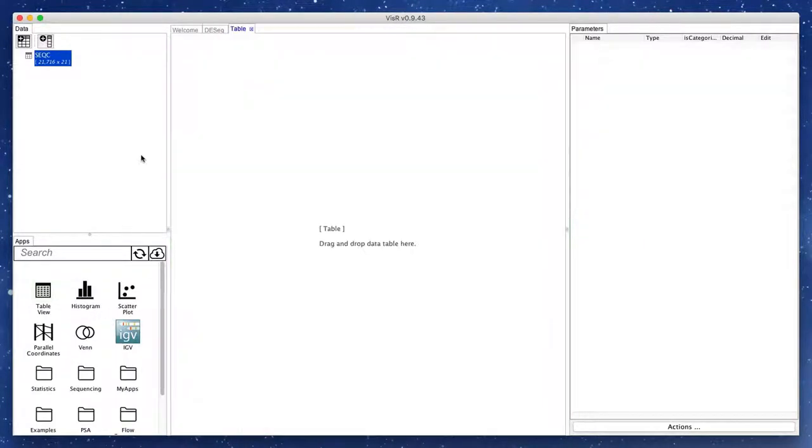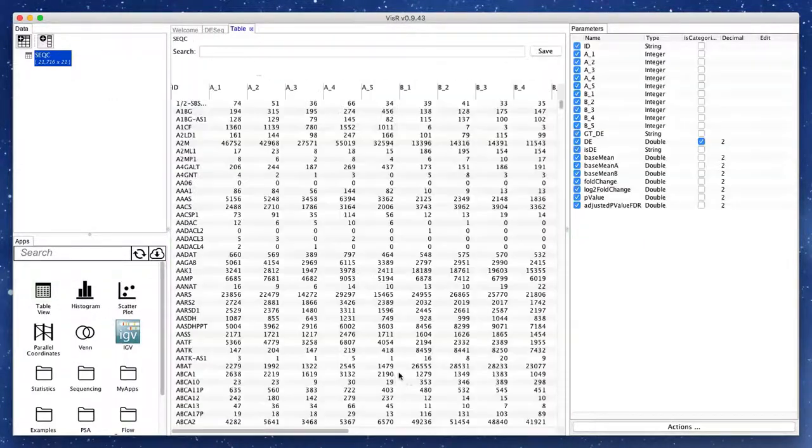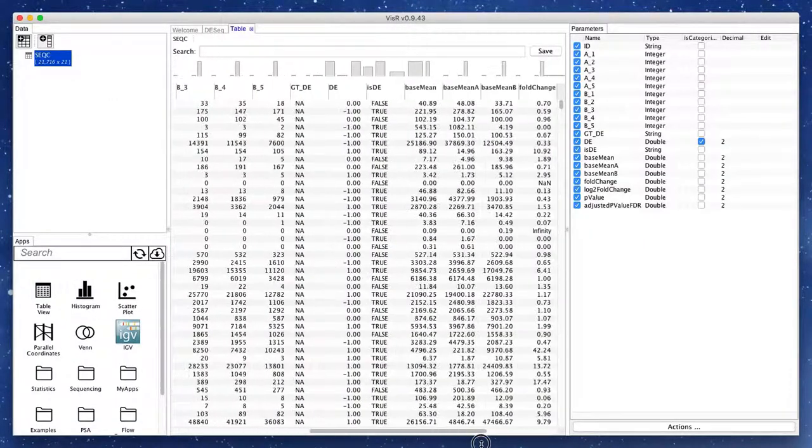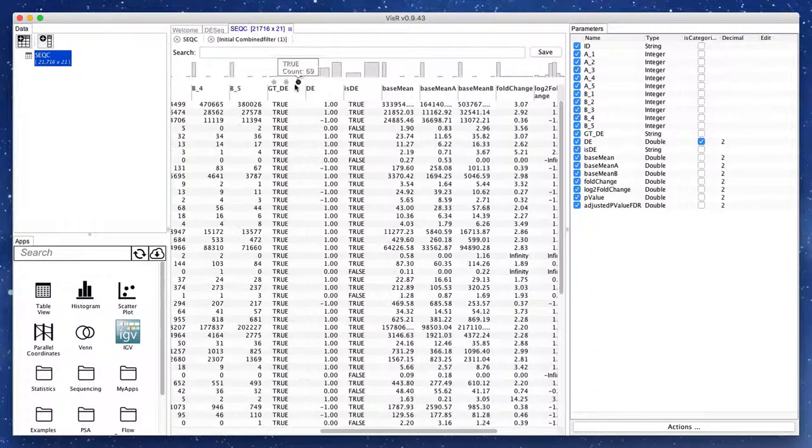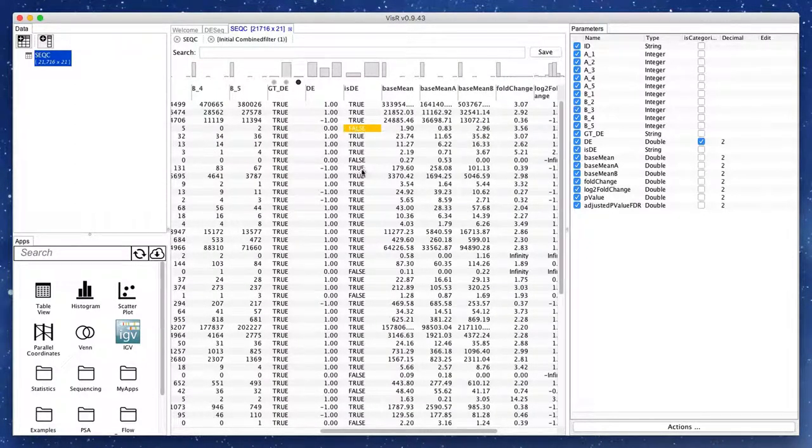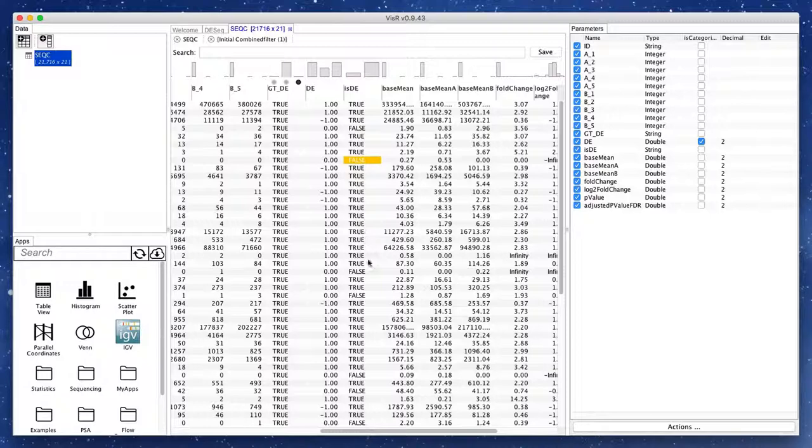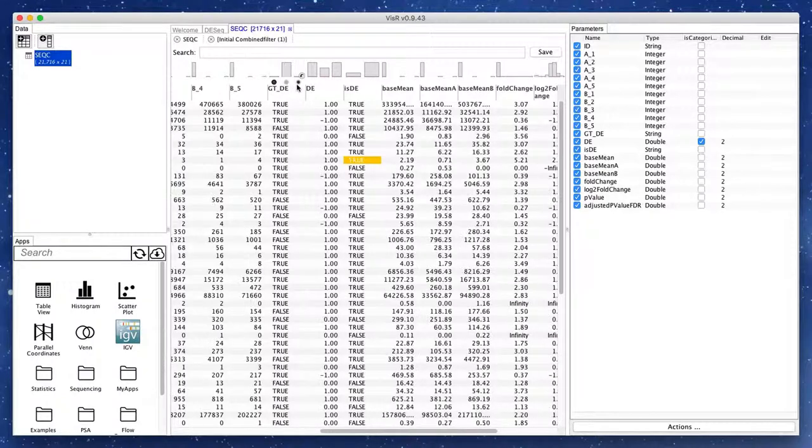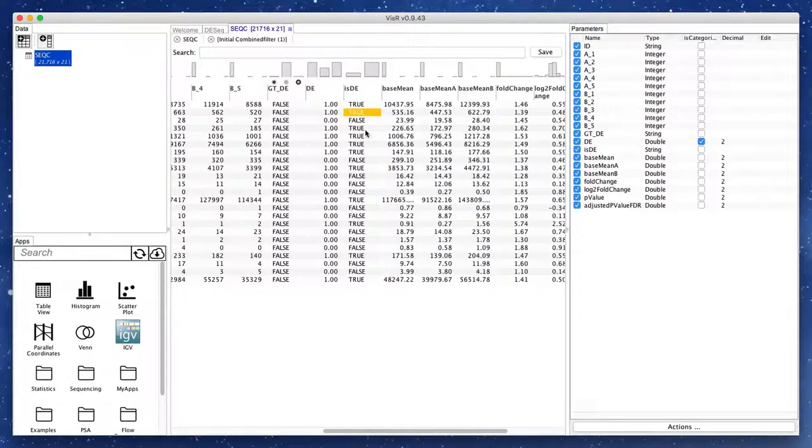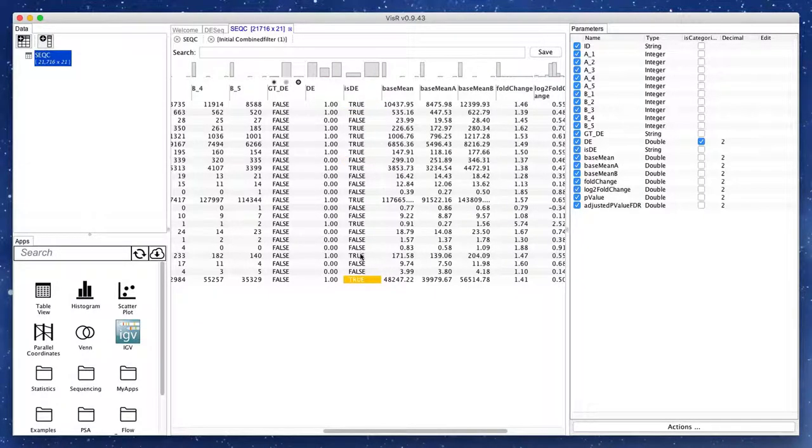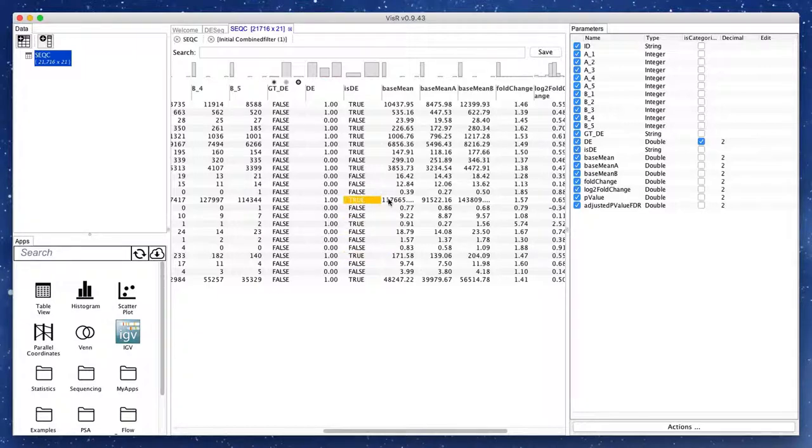Once again, we can use the TableView app to browse through the data. We can use the filters to see the false negatives and false positives in the output of DESeq. This brings us to the question of how should the detected DE state of other genes be interpreted. In other words, we want to know whether the statistical test that DESeq performed based on our input parameters was a sensitive test or a specific test.